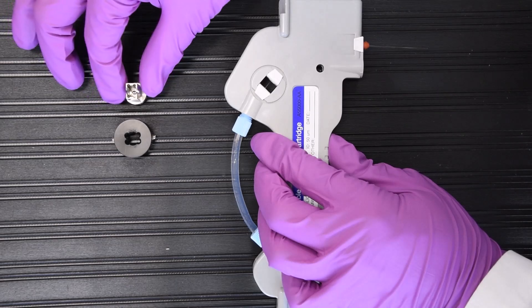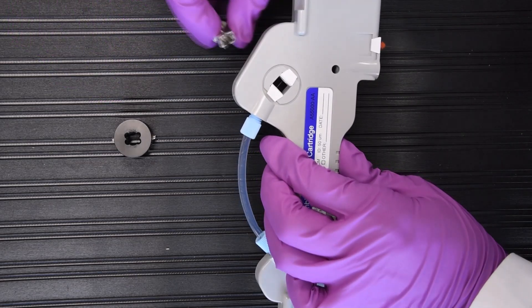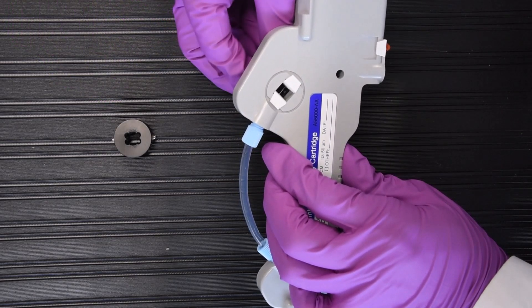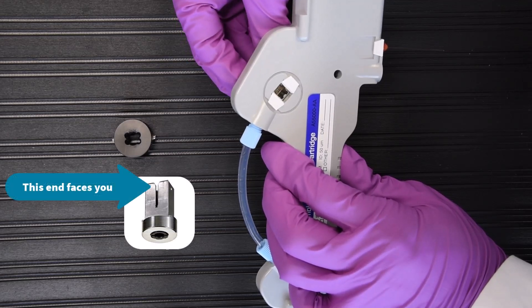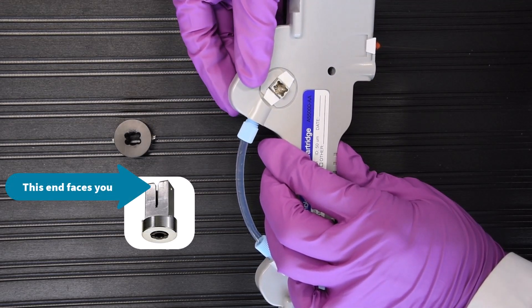To begin, take the metal LIF aperture and insert it into the cartridge from the back, making sure that the rectangular end is facing you once it is pushed through to the front.